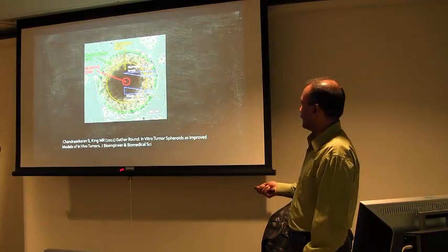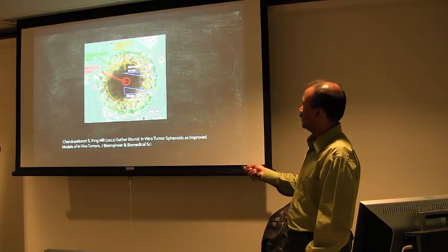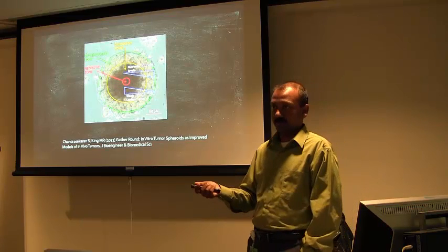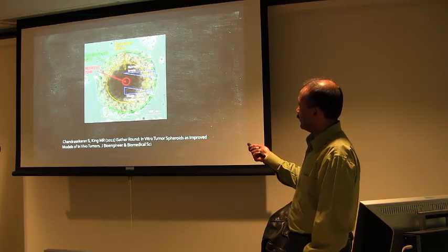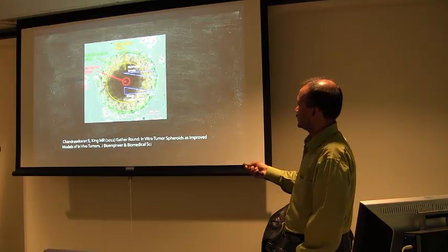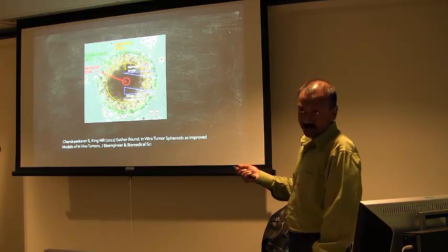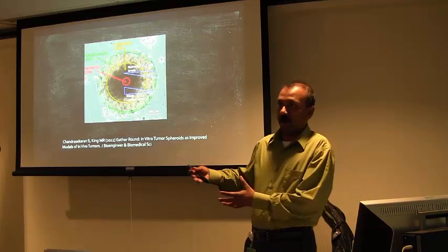This came out in a bioengineering journal, where they have shown that in a typical spheroid grown in vitro, you have 3 zones. You have a necrotic zone, where cells are dying from necrosis because of deficiency in oxygen and nutrients. Then you have a proliferating zone, the outer zone, where you get mostly differentiated cells, and they are actively proliferating and metabolizing because they have access to oxygen. And in between, you have a quiescent zone, where you have cells that are capable of dividing, but whenever they have some extra space to divide, they will divide.